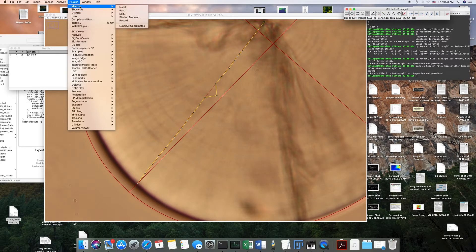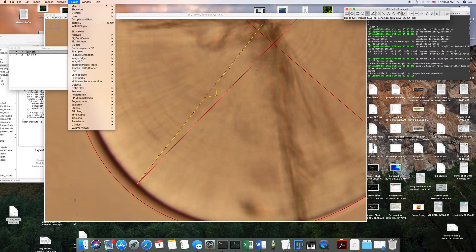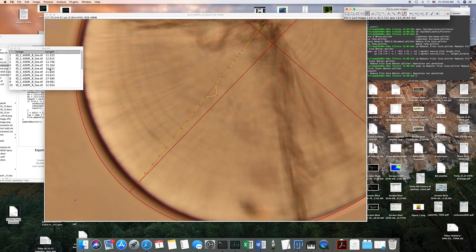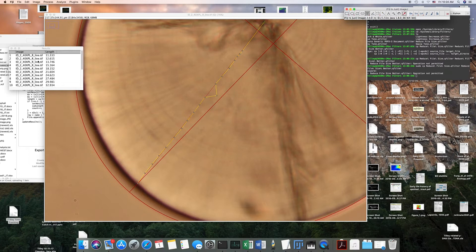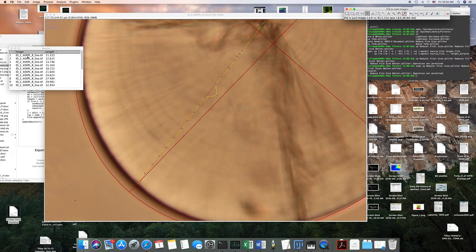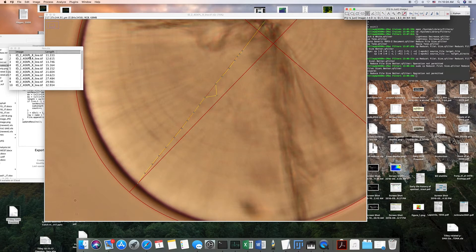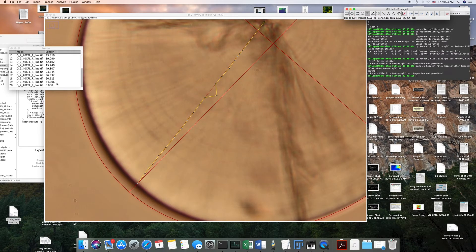And then I'll go to plugins and then I'll say export all coordinates. And so now you see what it's exported here. It'll give you the name of the image and it'll give you the first distance, second distance, all the way down.